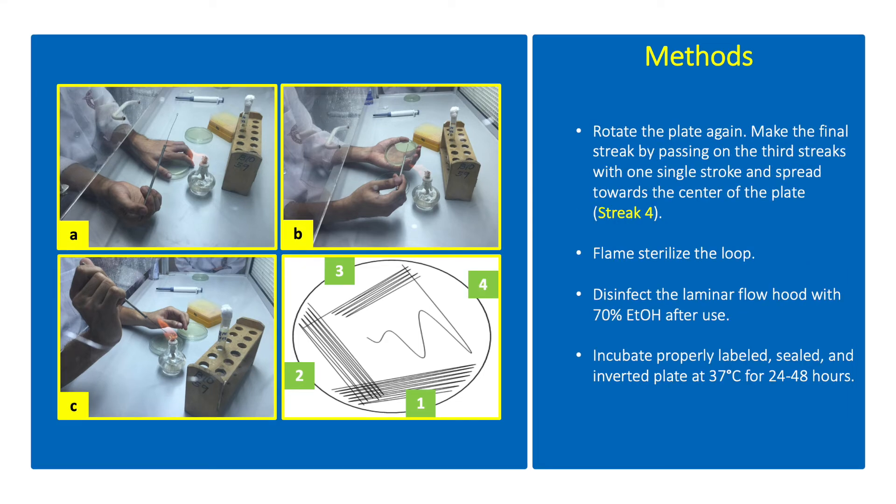Rotate the plate again. Make the final streak by passing on the third streaks with one single stroke and spread towards the center of the plate. Then flame sterilize the loop.